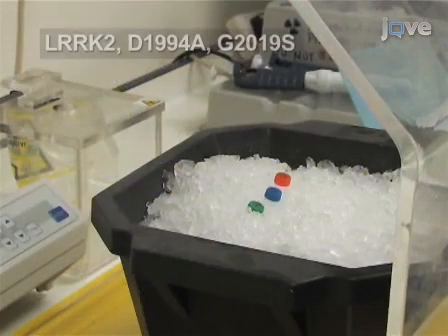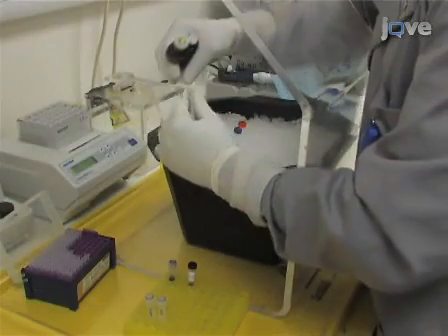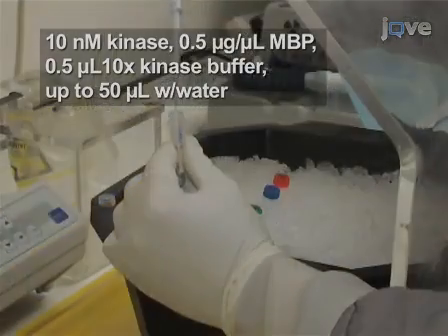Begin the assay by first thawing wild type LRRK2 protein as well as variants on ice. Then mix the following ingredients on ice: 10 nanomolar of kinase, 0.5 micrograms per milliliter myelin basic protein, and 0.5 microlitres of 10 times kinase buffer.